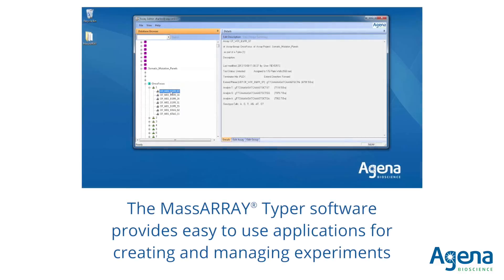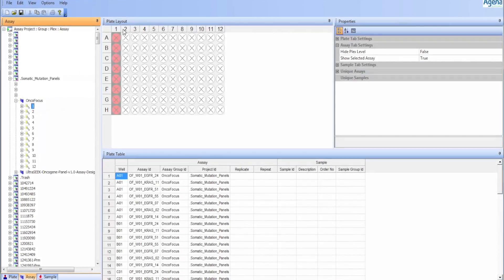Once the extension products are ready for analysis, the experiment can be set up via plate editor in the MassARRAY Typer software. Assays and samples are easily added to the plate, and all assay design files are stored in the MassARRAY database for future use.